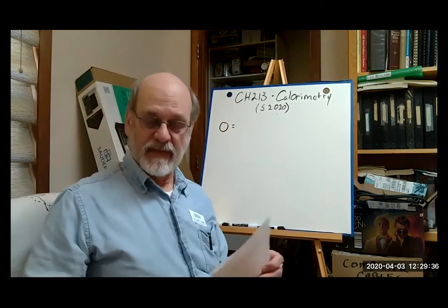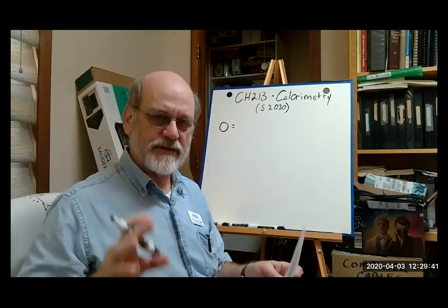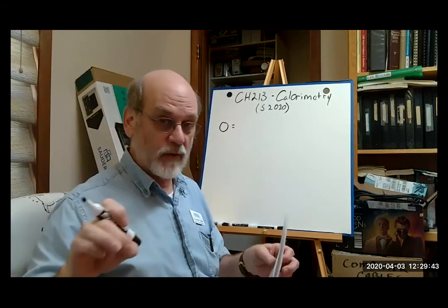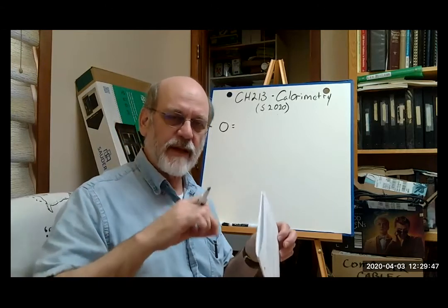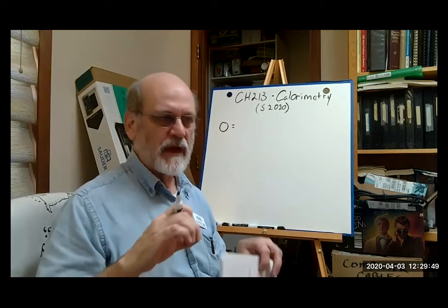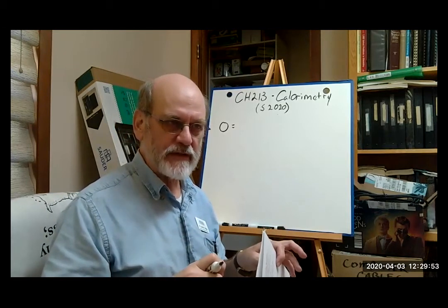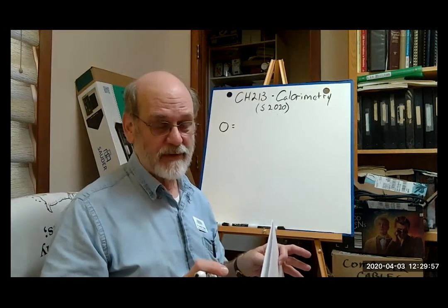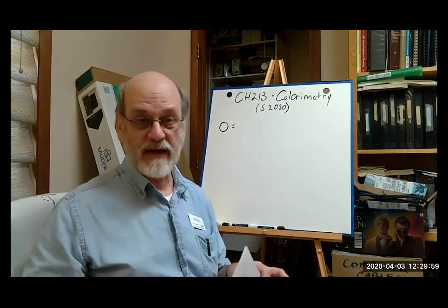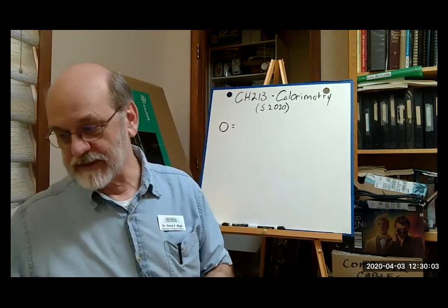And then we measure the temperature of the sulfuric acid, and that tells us the initial temperature of the calorimeter itself and the temperature of the sulfuric acid. What we want is for the temperature of both the sulfuric acid and the sodium hydroxide to be the same. If it is, that simplifies our calculations. If it's not, it complicates things.